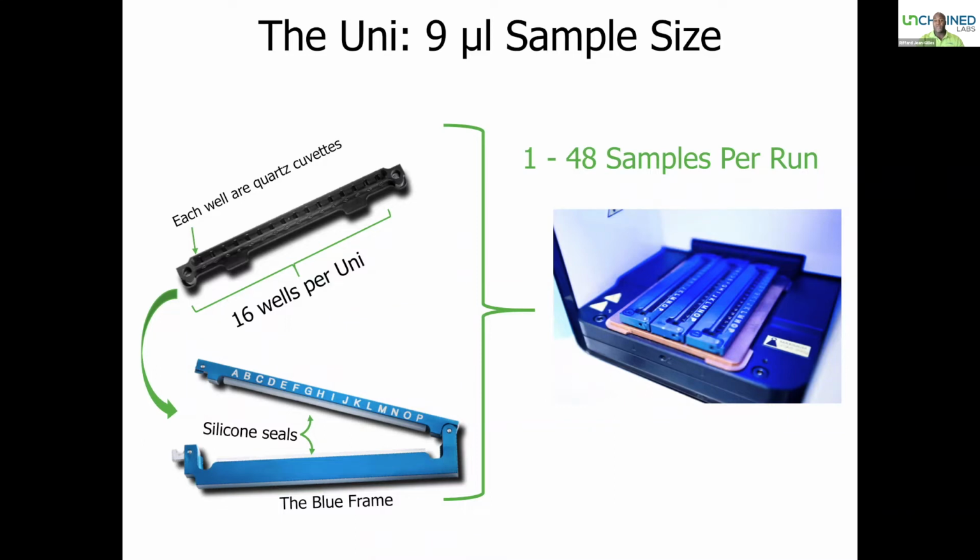And once you've done so, you can then assemble them and seal them into the blue frame that you see there and the silicone seals, which means that once they are sealed, they're completely inert. You won't have to worry about evaporation. You can also do long-term stability studies, meaning that you can hold a constant temperature for an extensive amount of time in the instrument, or you can take the sample holder, put it in your oven, or flash freeze it, and then come back periodically to the instrument and read the actual sample itself and perform a full experiment.